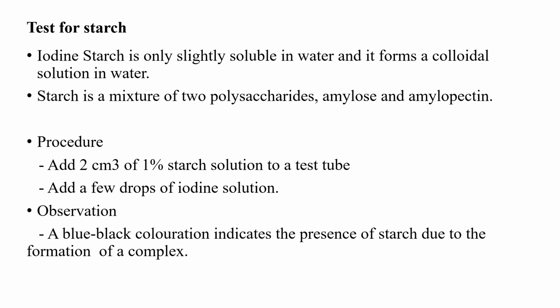So you prepare a mixture of starch, like the dry starch that we normally buy when we want to starch our clothes. Or in another way you can get something like yam, any food item that you perceive to have a large quantity of starch. You can grind it into powder form and make a solution of this. It could be yam, your yam flour, cassava or cassava flour or potato flour. You make a solution of this.